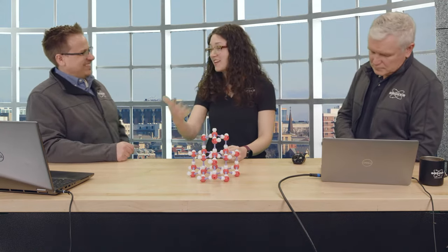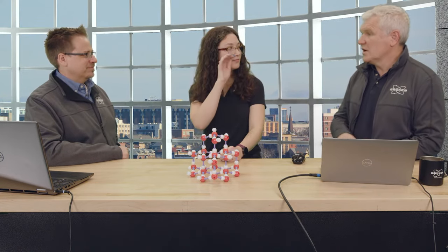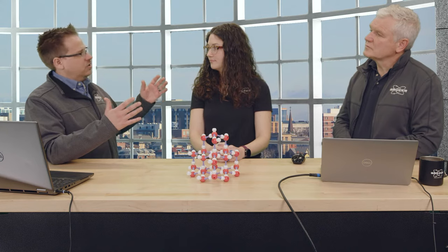What about silver? Is that just too high, and it'll condense these satellites too close to everything? Again, it all depends. With the uranium, I would have said absolutely go with silver. That's the best choice. And often these intermetallics have small unit cells. If you have a small unit cell, like 5-5-5 if it's cubic, and then you have a Q vector that's like 0.31, no problem. If your Q vector is like 0.002, then you would not be able to resolve this. You probably wouldn't even see this. In that case, you could take that detector, push it farther back, get better separation, things like that.